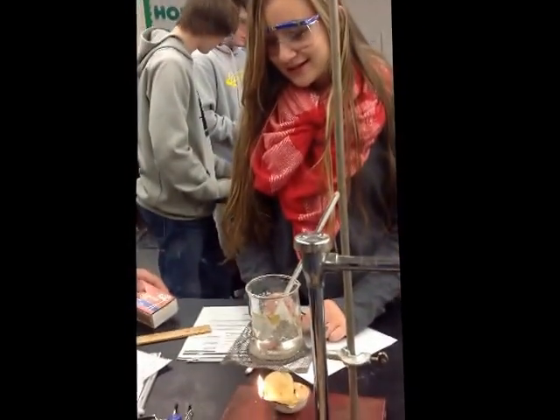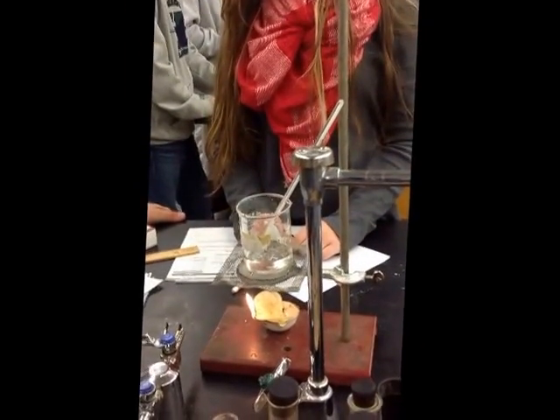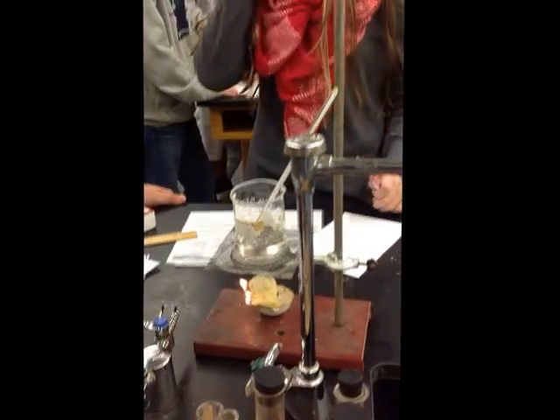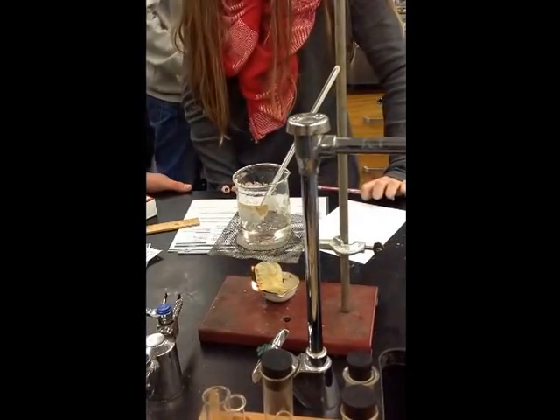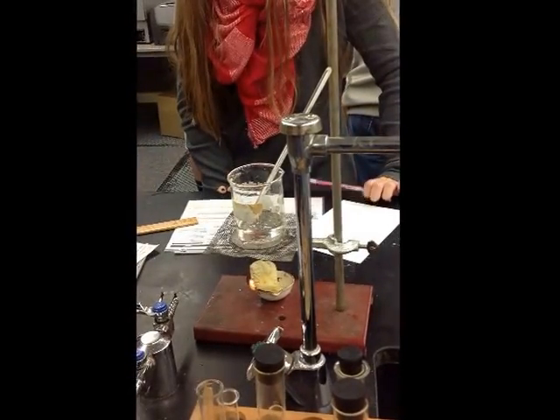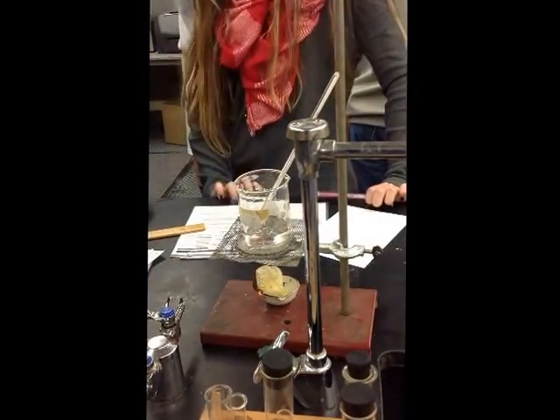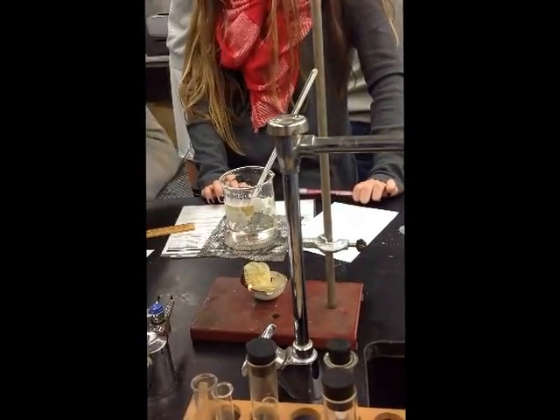Whoa, over here we've got action. Notice that they have lit their potato chip underneath the beaker. Notice that they have a thermometer in their beaker measuring the temperature of the water. The potato chip is giving off heat to the water. As the potato chip gives off heat to the water, the temperature of the water rises. This lab group is trying to figure out how much energy is released from the potato chip and given to the water.